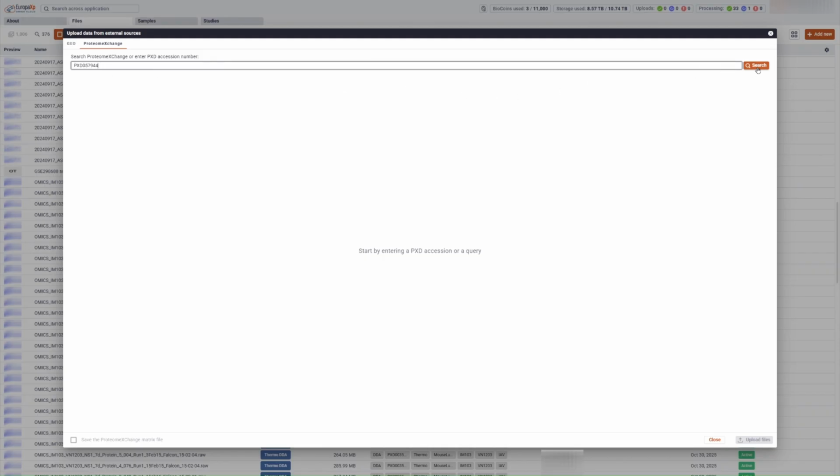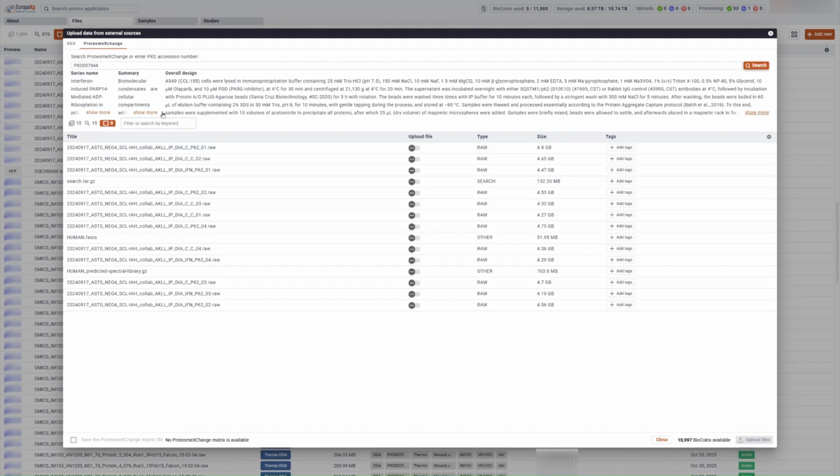The summary you see here is the one ProteomeXchange ships with the dataset. During retrieval, our AI also generates an augmented summary that captures sample groupings and design details, often beyond what's in the structured metadata. We'll see that augmented summary do real work when we get to annotation.